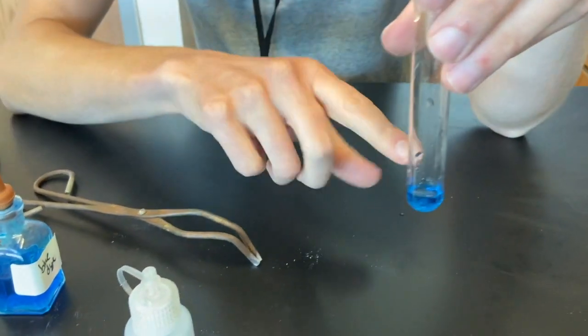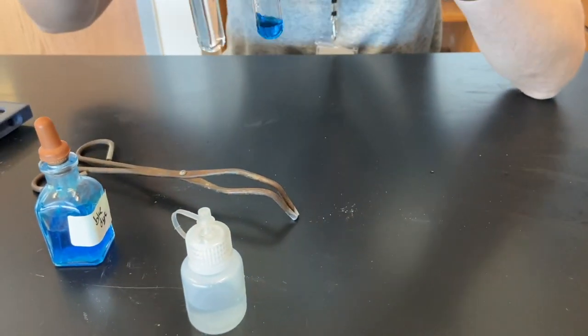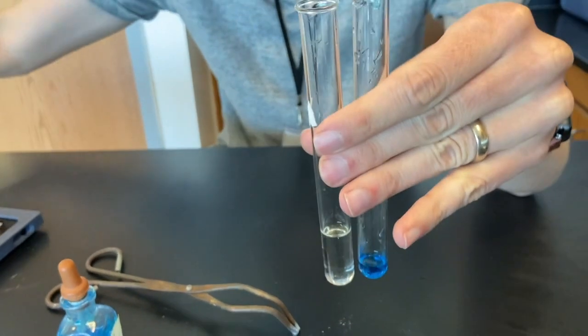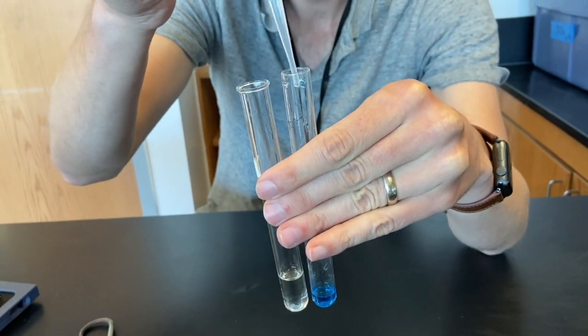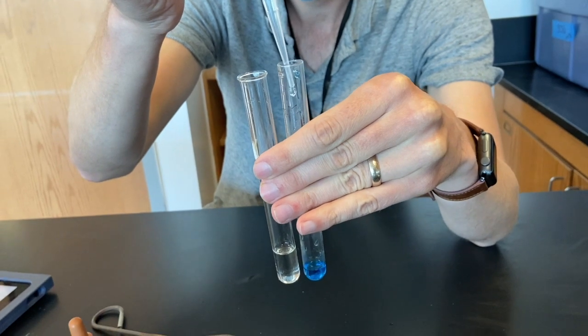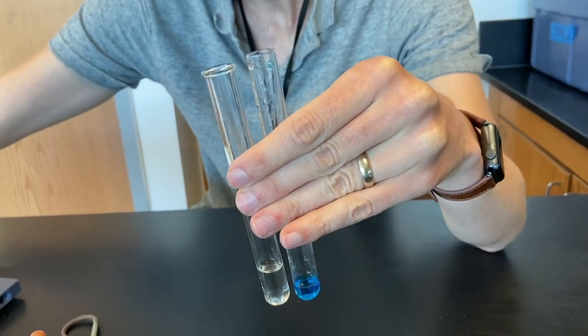Okay, so we have our 15 drops of the blue dye. We're adding five drops of the NaOCl, so here we go: one, two, three, four, five.